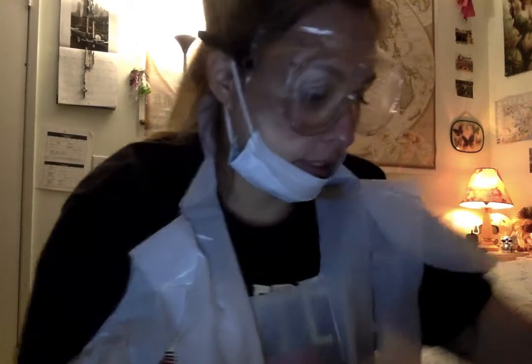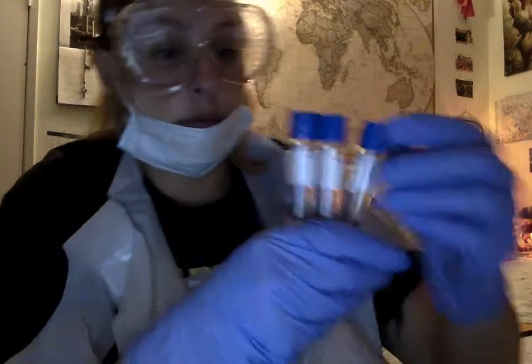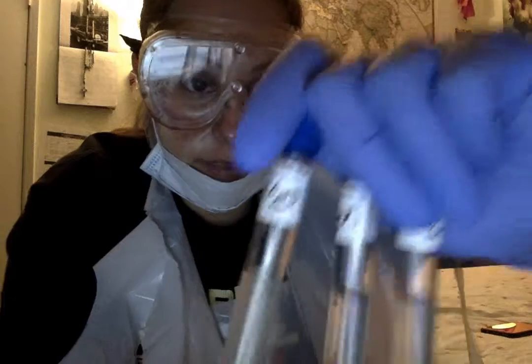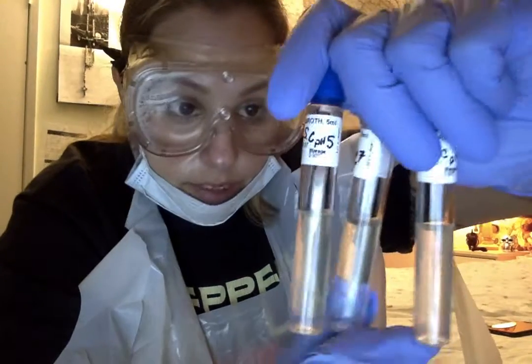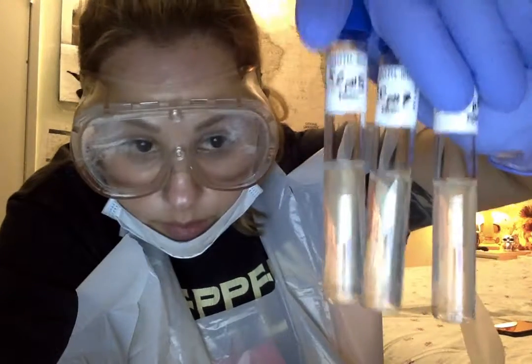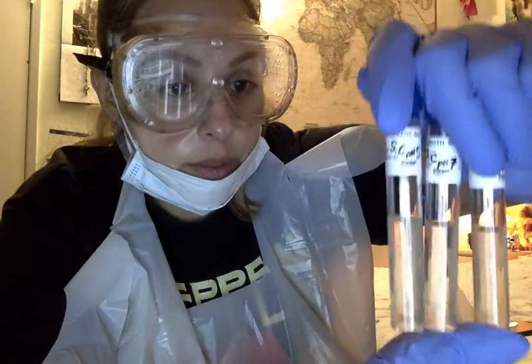And then for the S. cerevisiae, these in order. Okay, this is pH 5, 7, and 9 right here. Actually, on all of these, they all look like they did develop some sort of turbidity. My pH 7, not as much as the other two. It's kind of hard to tell in the video though. But this one not as much, but still some turbidity.